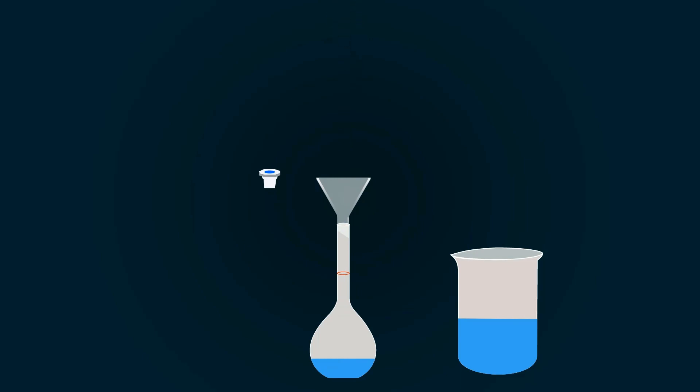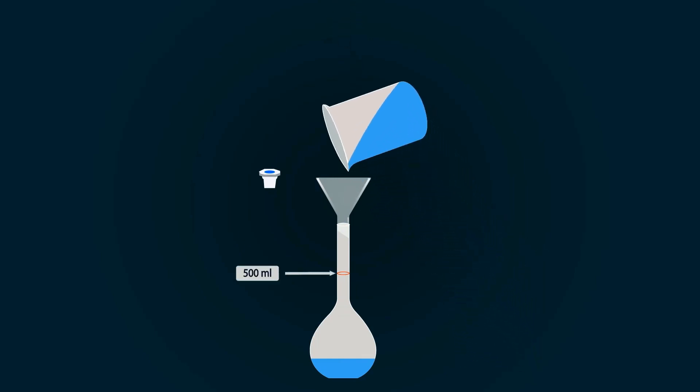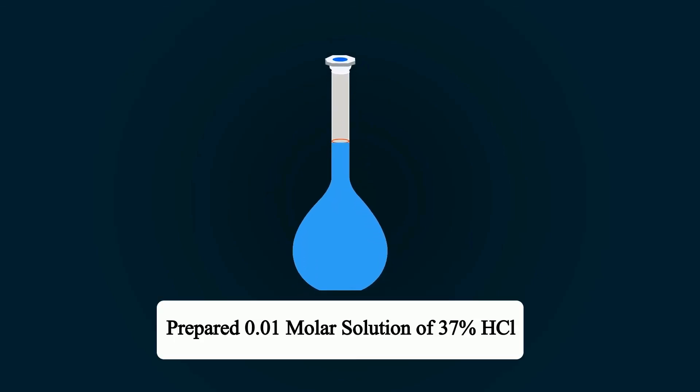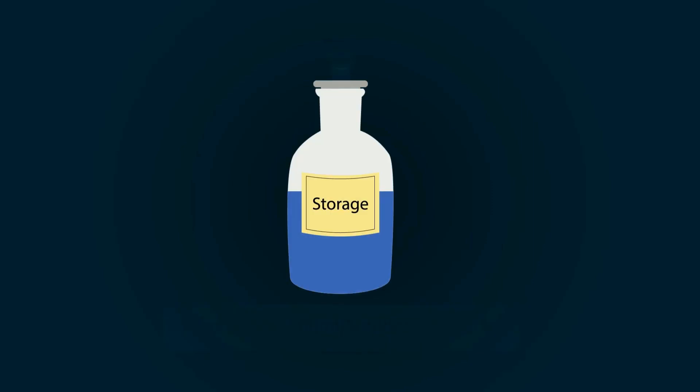Now fill the distilled water up to the 500 ml mark. You have successfully prepared 0.01 molar solution of 37% HCl. You can store it in any bottle you want. Thank you.